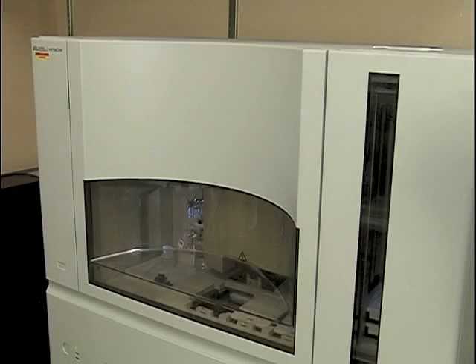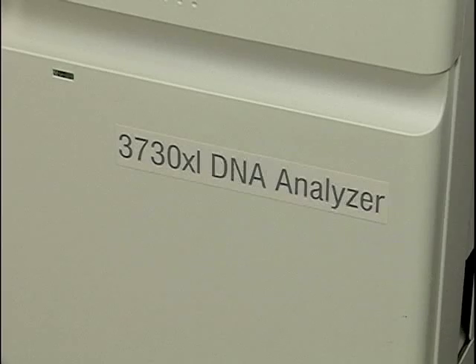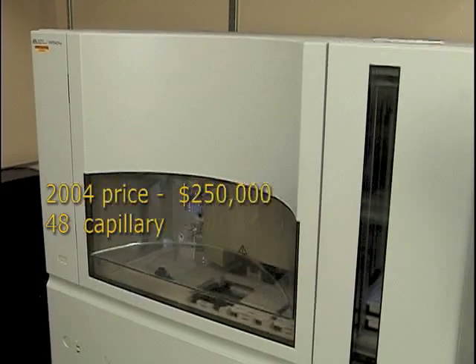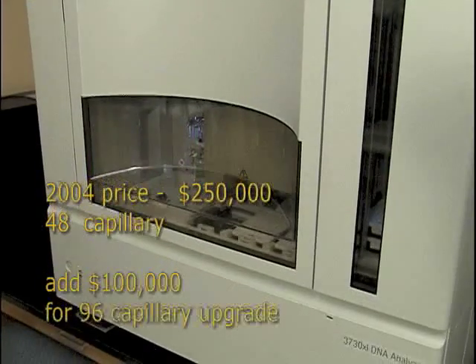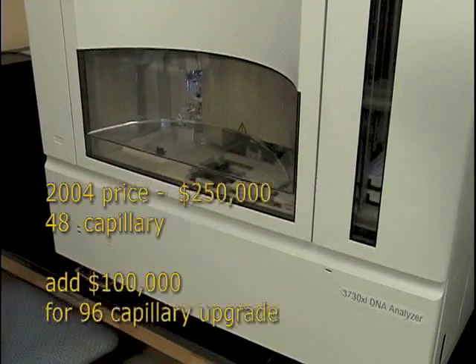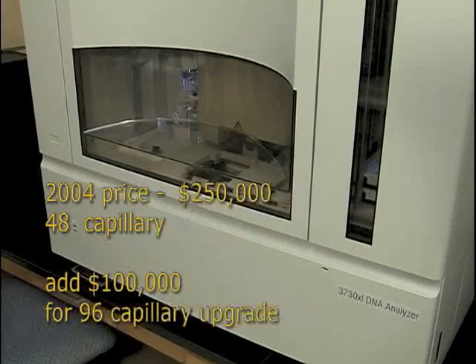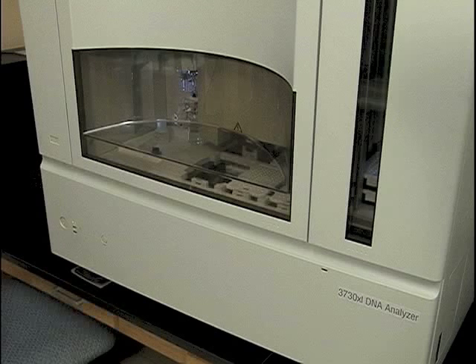To address and overcome these problems, new instrumentation was developed in which DNA fragments could be separated by size using a special polymer in capillary tubing, instead of a polyacrylamide gel. This is the facility's Applied Biosystems 3730XL DNA Analyzer. It was purchased in 2004 as a 48-capillary model for $250,000, then upgraded two years later to its present 96-capillary configuration for an additional $100,000. This is a very well-designed instrument and is still the state-of-the-art instrument for fluorescent Sanger sequencing.